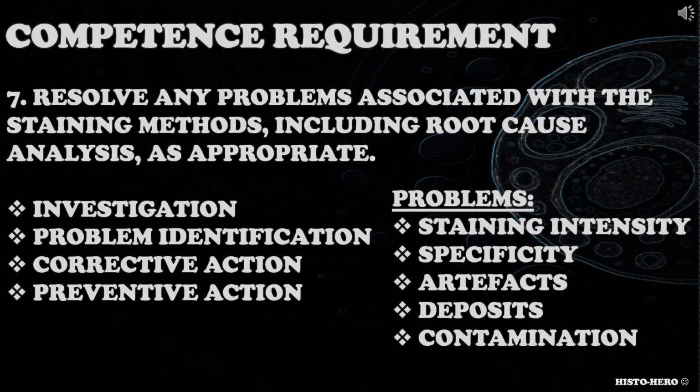Consider investigation, problem identification, corrective actions to fix the issue, preventive actions to minimize problems from reoccurring. Consider possible problems like poor staining intensity, poor specificity of staining, artifacts like uneven staining, hazy slides, presence of deposits or precipitate on the slide, reagent contamination, and so on.